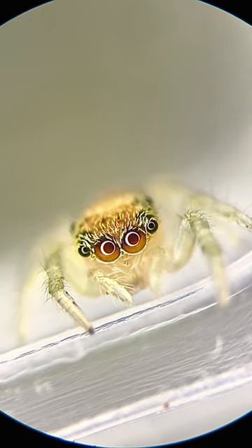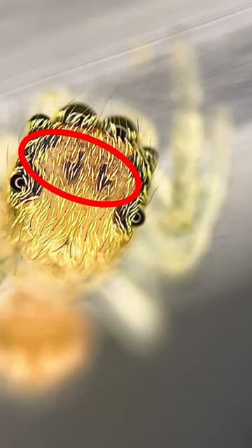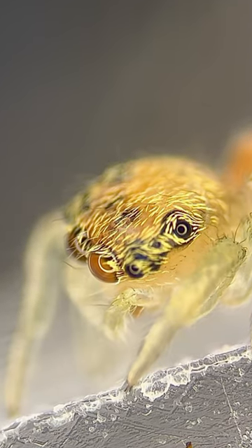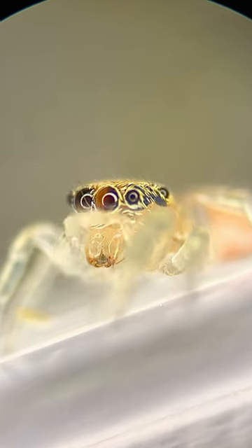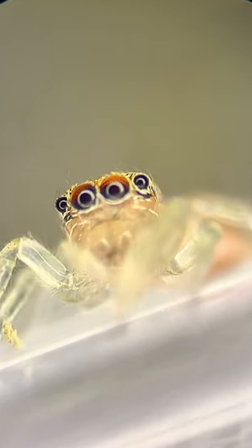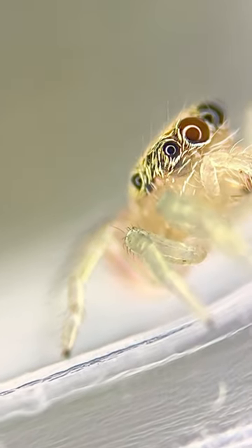They remind me of a telescope. And this is quite fascinating because we can actually see them moving inside the spider's head, side to side, contracting and expanding. Like a DSLR camera, the spider is adjusting its depth perception, and it is gauging the distance between things. This is incredible. Let me know what you want to see next under the microscope.